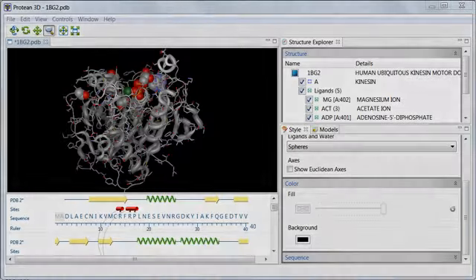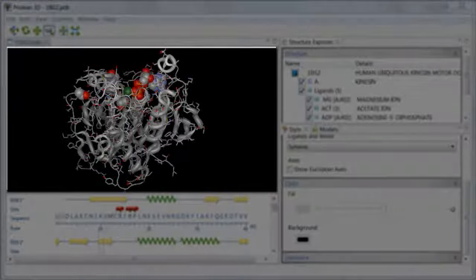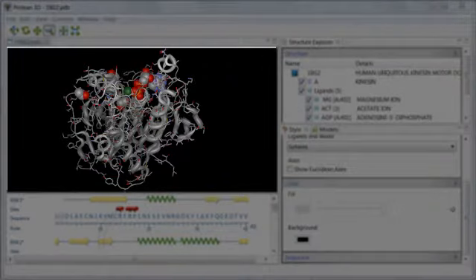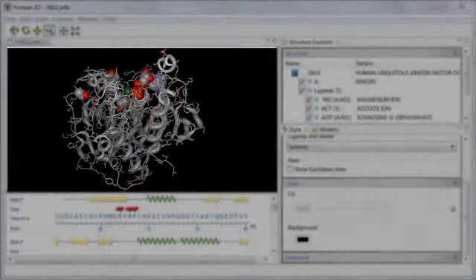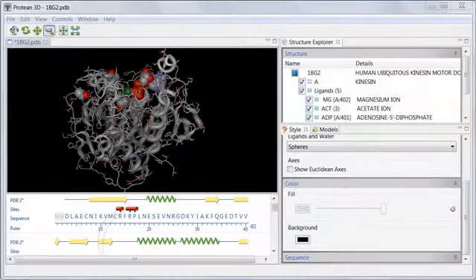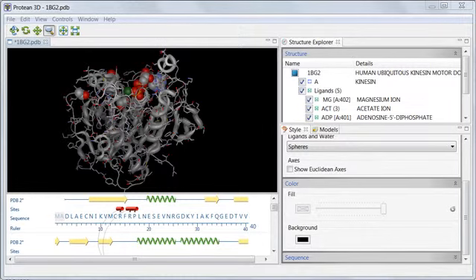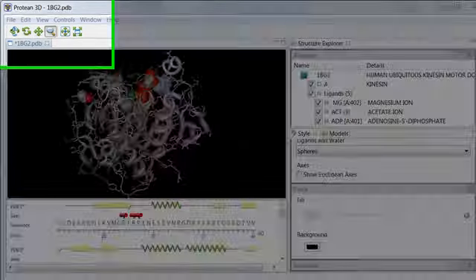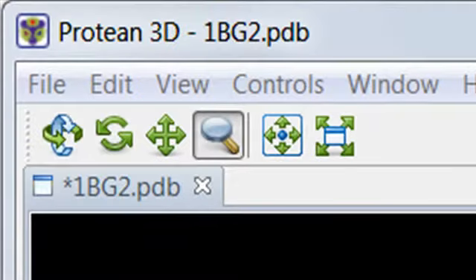Once you've opened a PDB file, the structure view shows a graphical representation of the molecular structure. In this example, I'm looking at a kinesin molecule, which is PDB entry 1BG2.